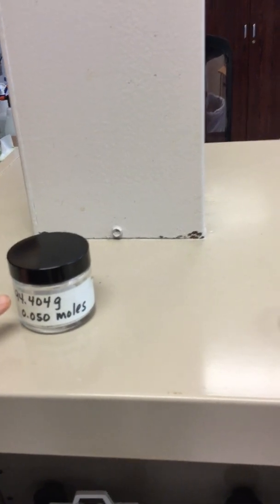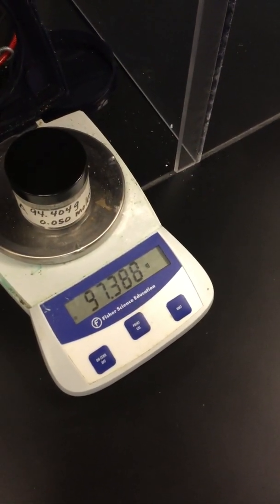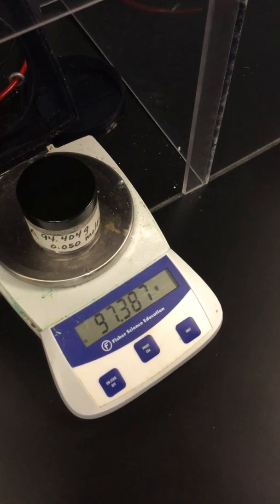So that was the mass when it was empty. I put in 0.050 moles, and now this jar has a mass of 97.388 grams. You'll notice 94 written on the jar, that's the empty mass. It now weighs 97.388 grams. So you guys can calculate the difference. All right, that's station 12.